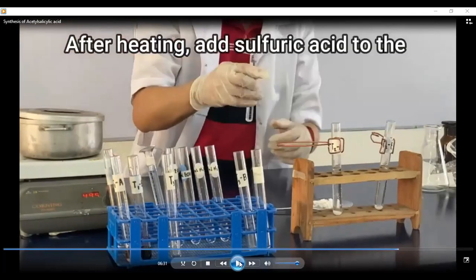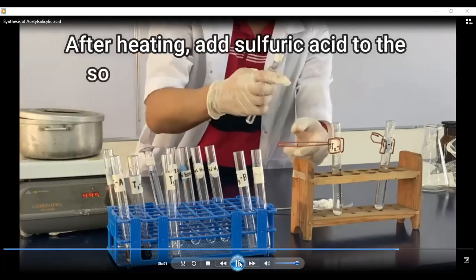Are you familiar with the test tube holder that is used during heating? Apart from holding the test tube, its purpose is also to hold and stabilize it while using the water bath, so you can let it be sometimes while heating. So going back to the experiment, after heating the solution, we added sulfuric acid.